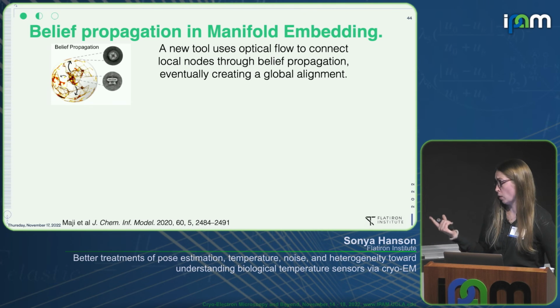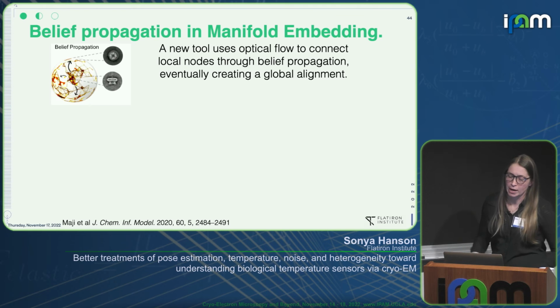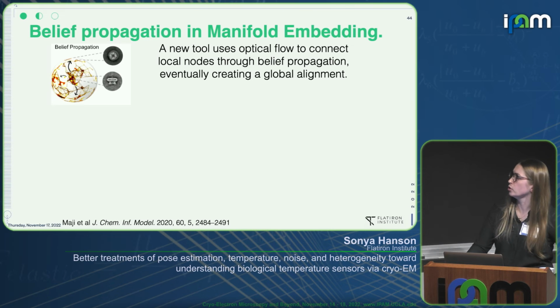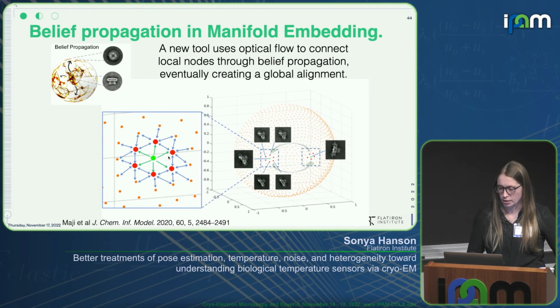In practice in the ribosome and ryanodin receptor papers, this was all done manually, and in the work I'm about to show you, connecting up these projections was also done manually. But it's nice to see this work from Suvrajit showing how you could do this automatically, and now the existing Python GUI allows you to do this with Suvrajit's toolkit, which is very nice.